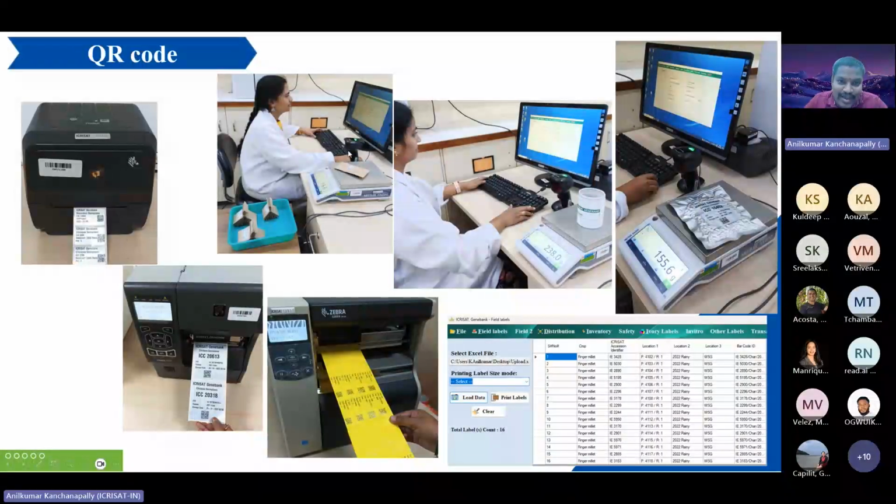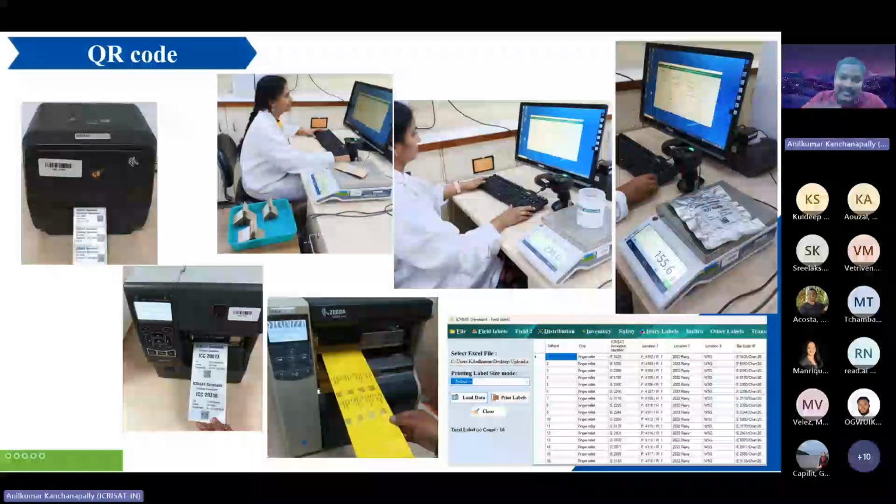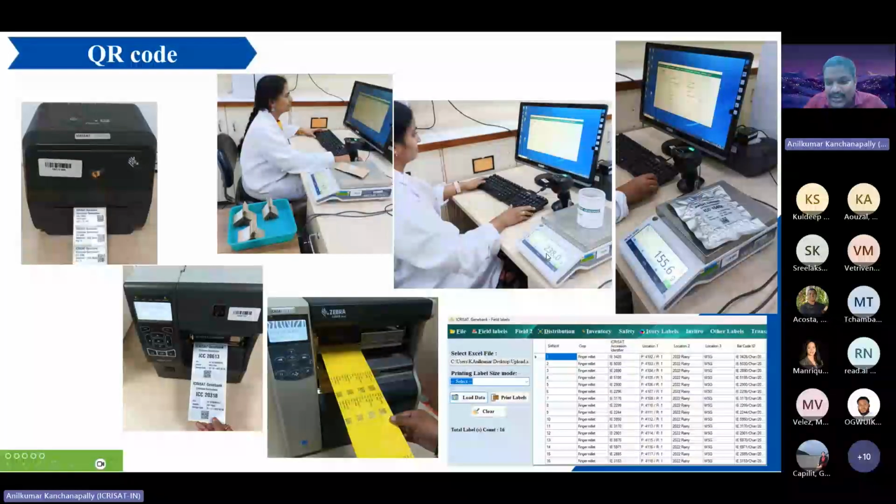So when we click on update, this 19.6 gram will reduce from the original weight, and this 19.6 gram will be tracked in the transaction. This is reducing the weight. Here, if you see the bottle, 238 gram, this is increasing the weight.